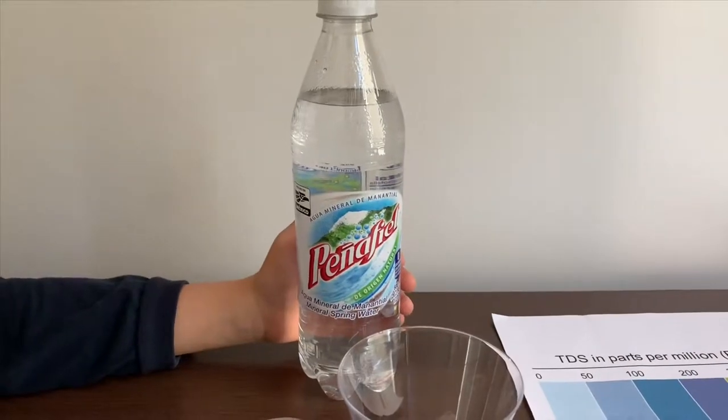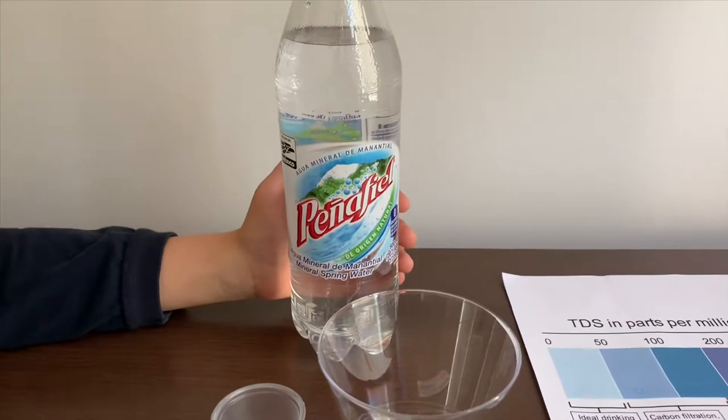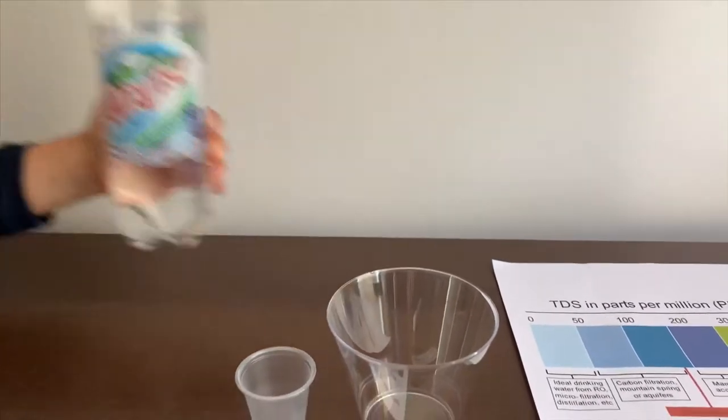This is Peñafiel mineral spring water. It costs $1.29 and is sold from Mexico. Let's test the pH and TDS levels.